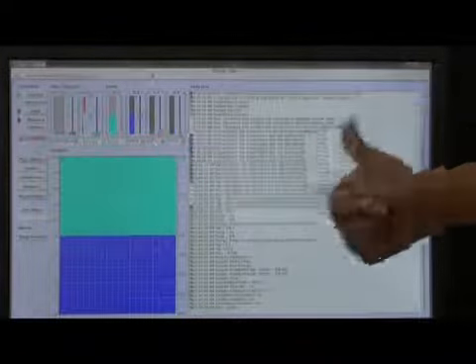We will use the same program in the method in Excalibur. When we go to Excalibur, I will show you how to make an LC method in Excalibur. The method that you will use in Excalibur will run automatically. This is just for the startup. You start the LC like this. Okay. So until this part is okay.